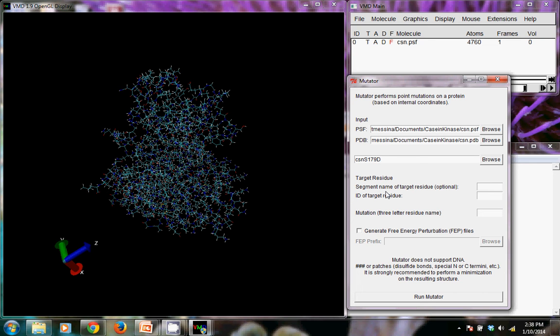But as I say, I'll show you how to actually do a phosphoserine mutation in a future video. Okay, so the target residue is the next thing here.